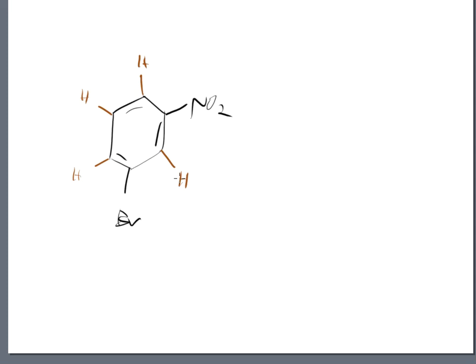All right, so now let's move on to B. And for B, we saw something very similar. We saw a ring system here in the middle, and we saw this alternating double, single, double all the way around. And we see an NO2 group just like what we had in A, and we also see a bromine just like we had in A, but they are separated now by 1 carbon. All right, so the basics of that problem are still there. There's nothing special here, and I'm going to look at this and I'm going to go, oh, you're not going to trick me. So there is a hydrogen here, and there's a hydrogen there, and there's a hydrogen here, and then there's going to be a hydrogen there. So we need to determine the number of chemical shifts.